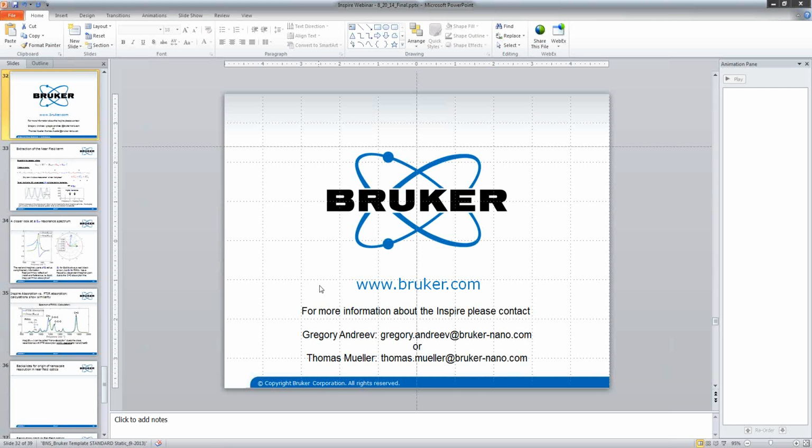Thanks. And there was another question maybe related. Does the SPIR technique work in contact mode or in tapping mode? The SPIR technique works in tapping mode as well as PeakForce tapping using interleave. So tapping mode is required in order to modulate the tip sample separation distance in order to modulate the near field contribution to the detector voltage.